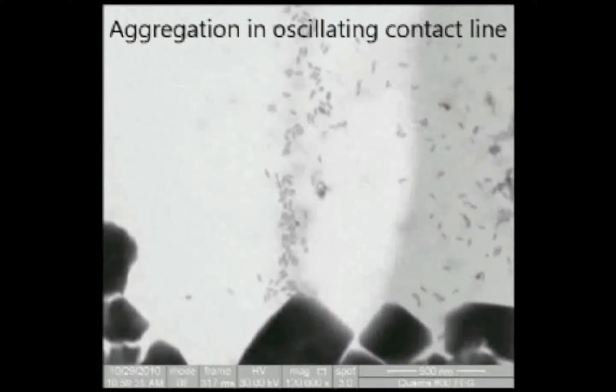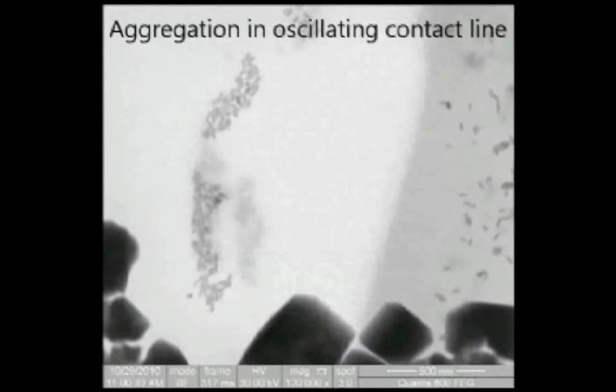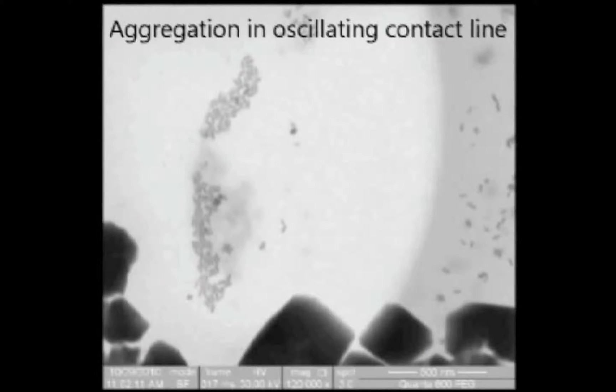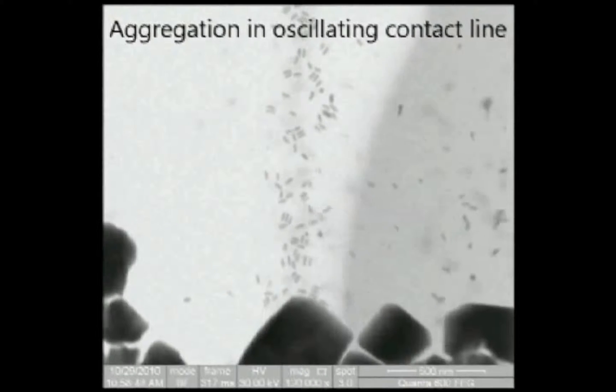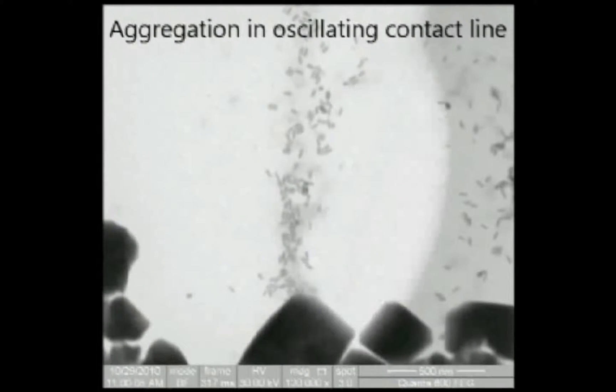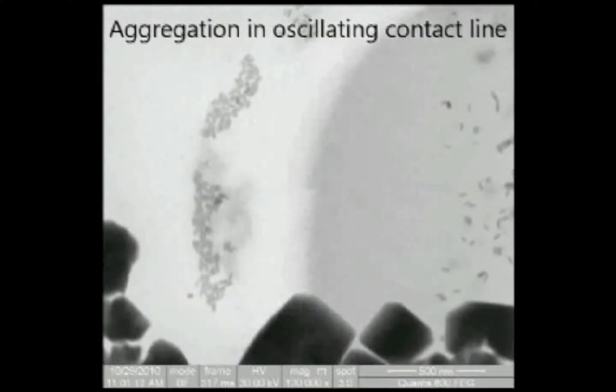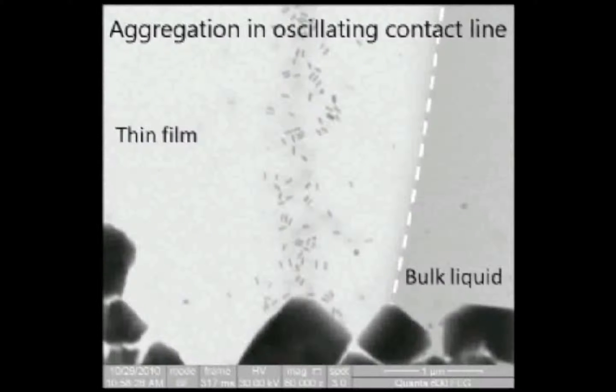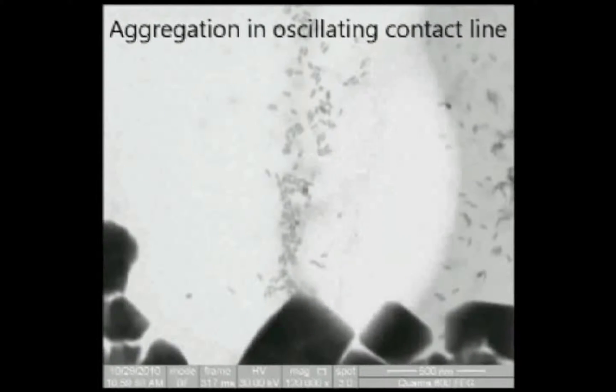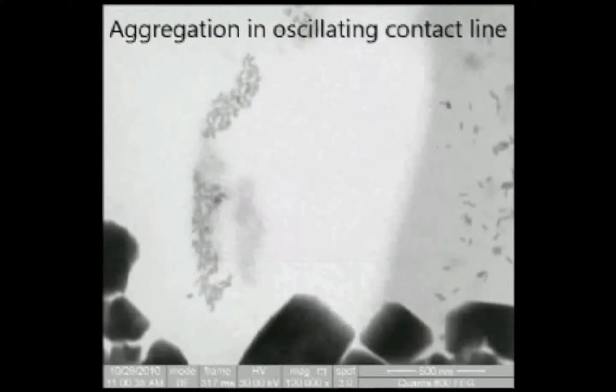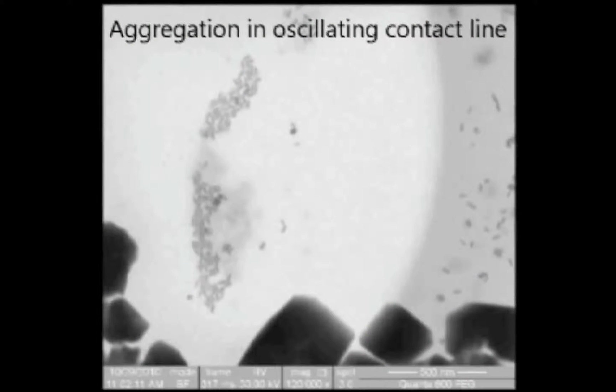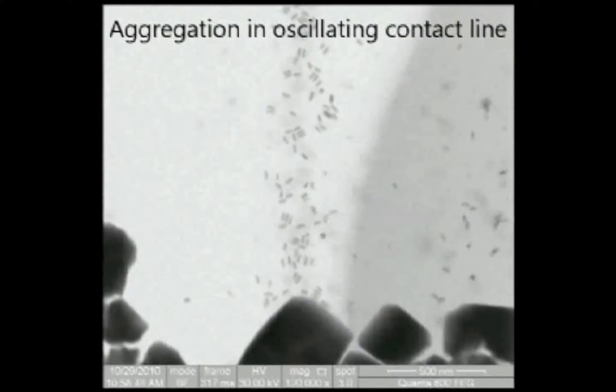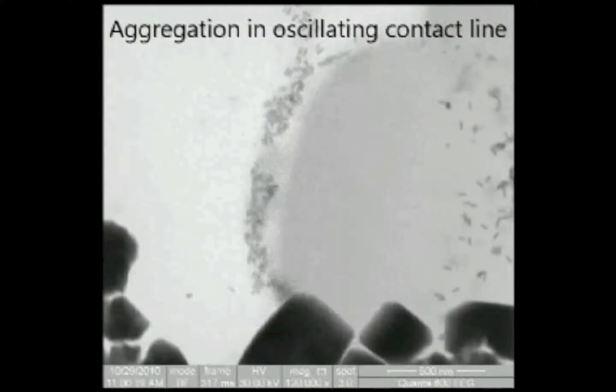Now we'll image another region of the device, and here we have some very interesting behavior going on with the interface. These large clumps on the bottom, those are salt crystals on the outside of the device that are left over from the manufacturing process. Though they serve as a nice measure of distance, they do not affect directly what's happening in solution. They will affect what happens to the electron beam. Here we see similar results as to what we saw in the previous two videos, where this interface is moving these particles around, and it's still going to be mainly due to the interface motion. At the beginning of this video, you may have seen many particles coming and sticking to the window. This is implying that there's some sort of charging effect that's going on in this system that's causing both the interface to be unstable and to move, and for the particles to come into the field of view.